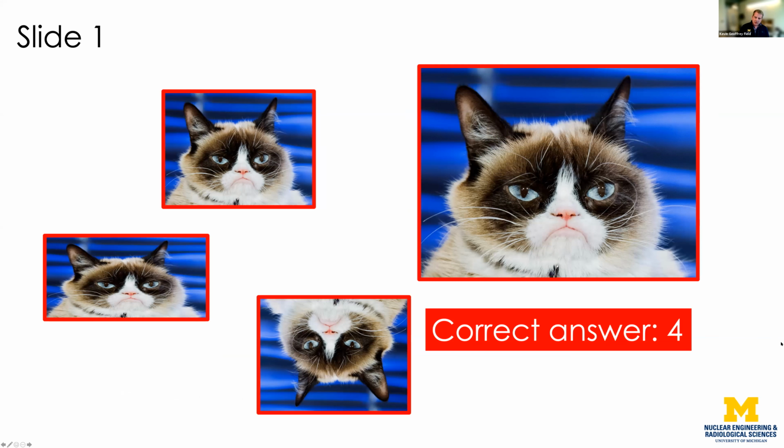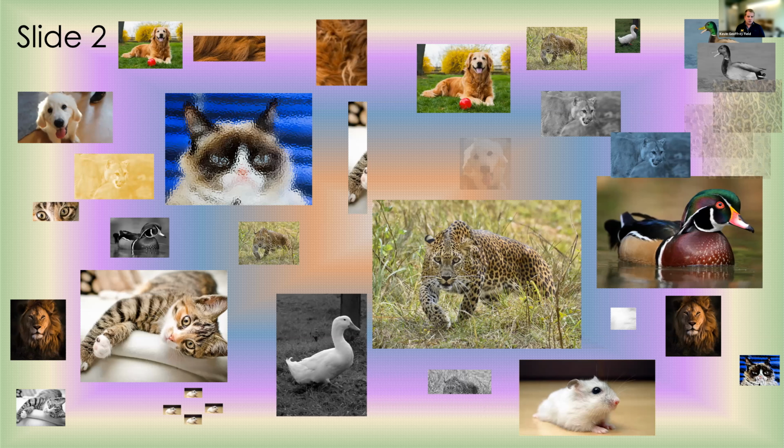And we had some image complexity, but the background was pretty consistent. And we had just small morphological changes of our features here, right? Now, if we think about our in situ data, it's going to look much more like this, right? So let's see how long it's going to take for people to count the cats and what number they're going to get here, right? So we have a very complicated background. We also have features that we're not interested in, and we may have cropped features that we are interested in. So we'll give people a sec here to give a response.